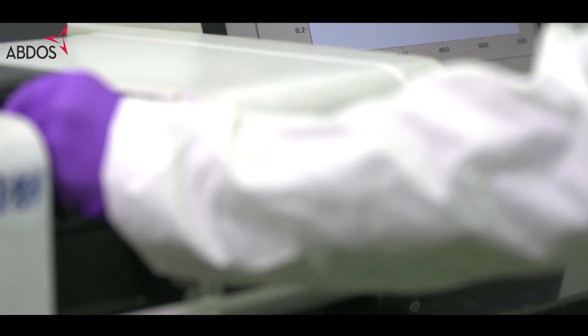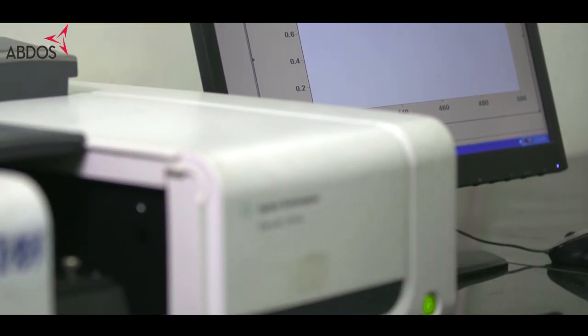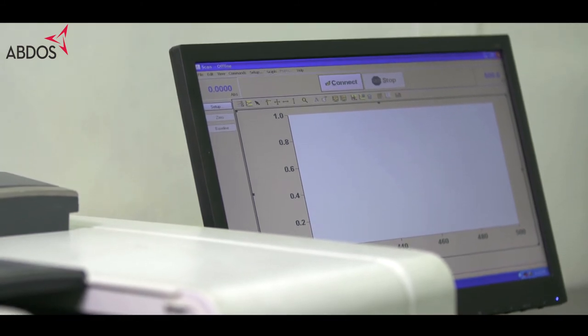To quantify and validate, you may rinse the pipette tips into cuvettes and compare them photometrically. You can observe a major difference between the two.